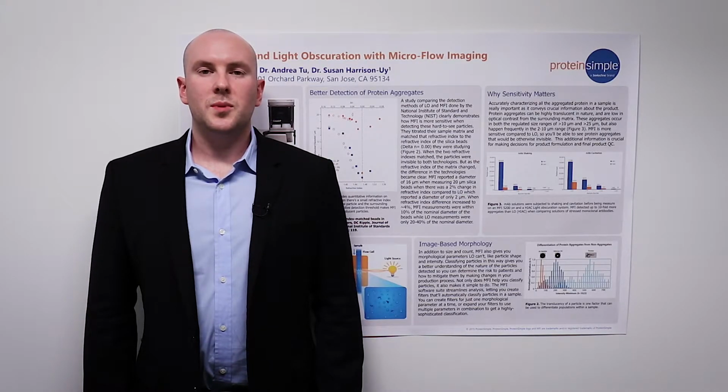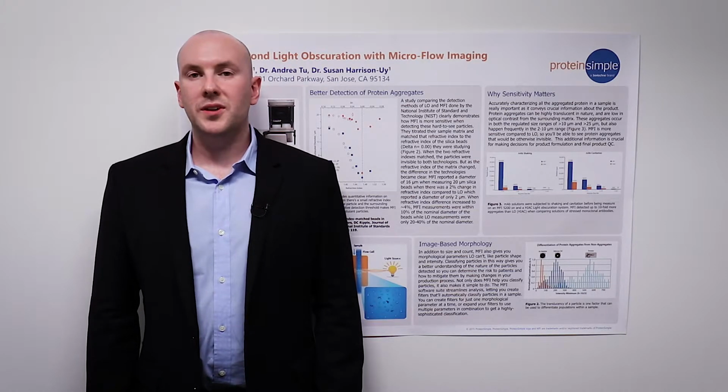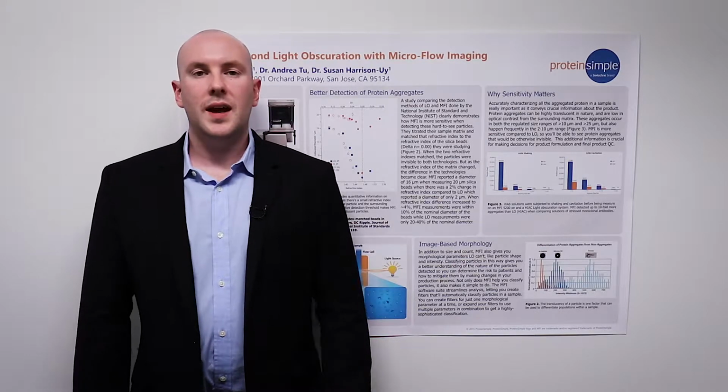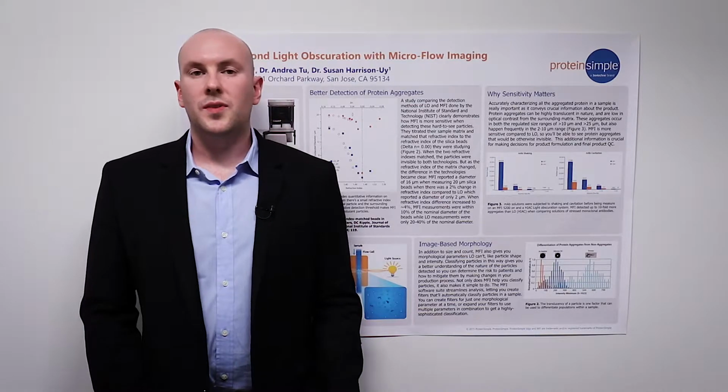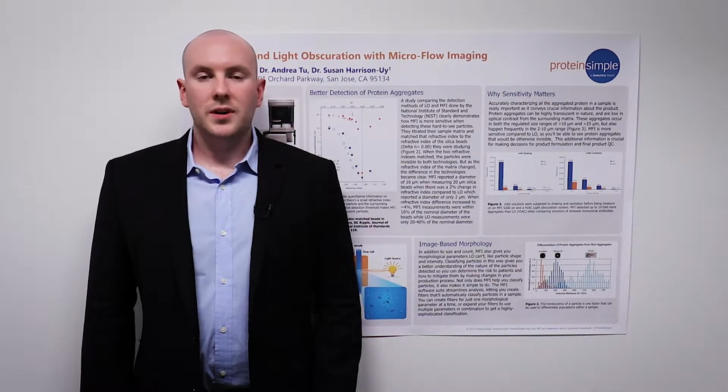receiving that therapeutic. The original research into subvisible particles in pharmaceutical products was focused on the risk of capillary occlusion, which could be caused by inorganic materials that had been introduced into the pharmaceutical during the manufacturing process, and these could include rubber, glass, or metal. To combat this, the technique of light obscuration was introduced to help measure and control these particles.